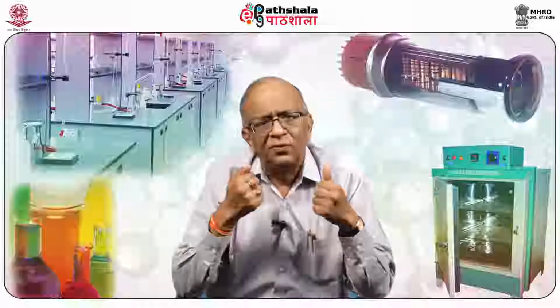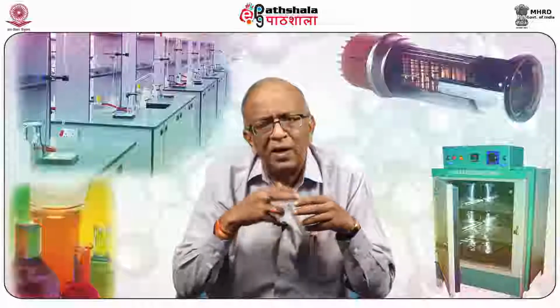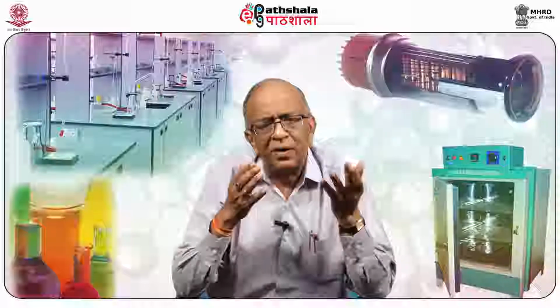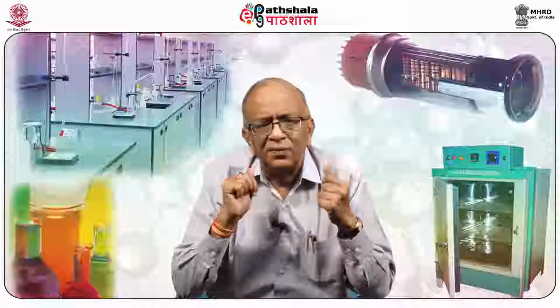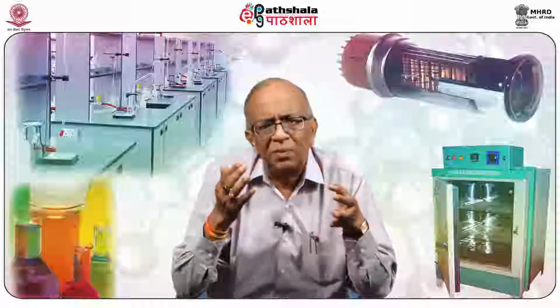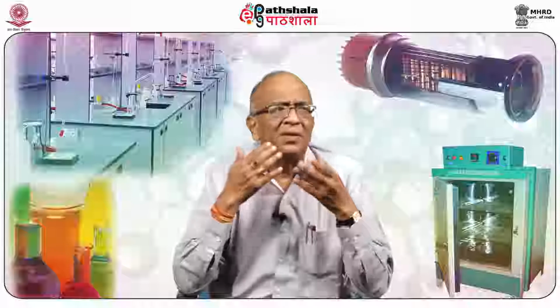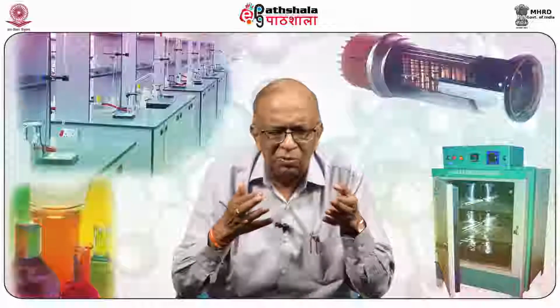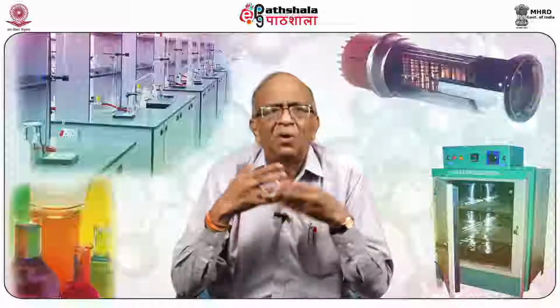Physical changes such as melting or boiling may occur at widely varying temperatures depending on the materials involved. Chemical changes such as decomposition or reaction may also take place at very different temperatures. So what are physical changes? As I told you, it is the conversion of water into ice or vapor.